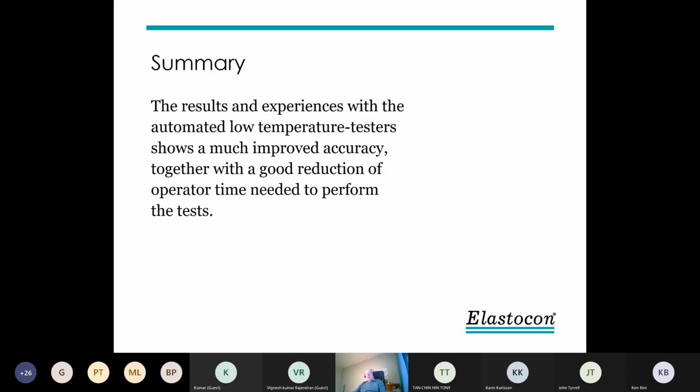So he asked us, could you develop a Gehman tester as well? And that was more tricky. But we made one. They even placed an order for 2 Gehman testers before we even had the drawing. And 9 months later, they got the first Gehman tester, and some months later, they got the second one. And they could motivate that by saying they saved money because the operators were not busy all day. But it's very few times you can have that as a motivation for, say, an automatic instrument.